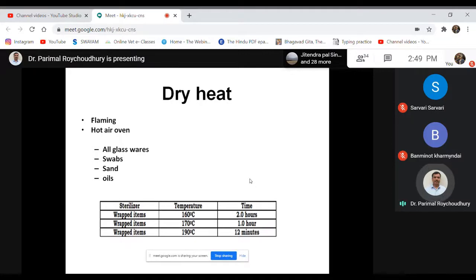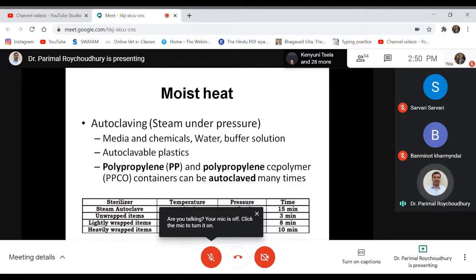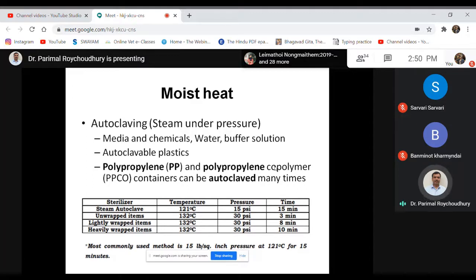In moist heat types of sterilization, there is high penetration power. Please remember, this autoclaving process is more effective because it has high penetration power. The steam and the pressure can penetrate deeper inside and cause complete clearance and killing of microorganisms. Here, the steam and the pressure can cause total destruction of the surface proteins and all macromolecules present in the organisms, and as such the organisms get killed.